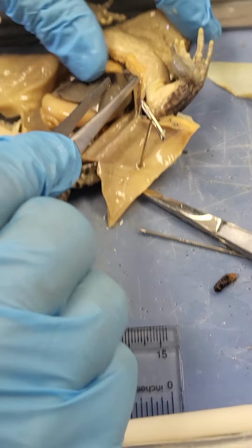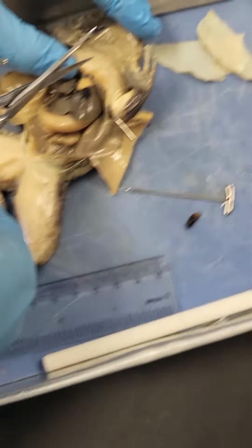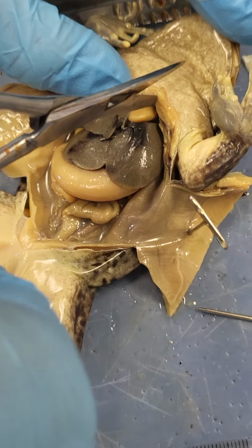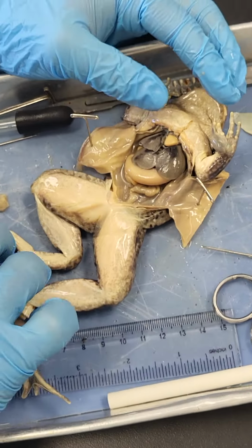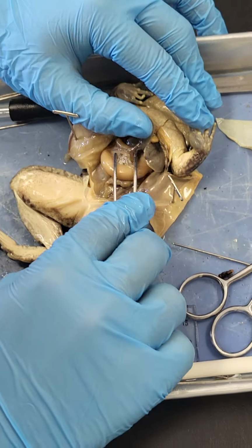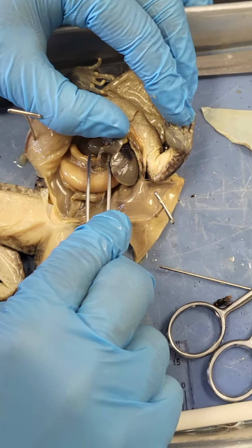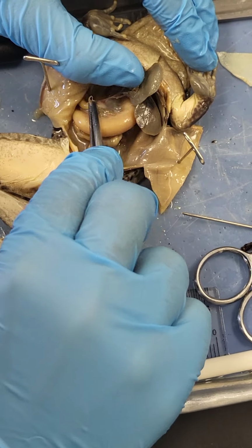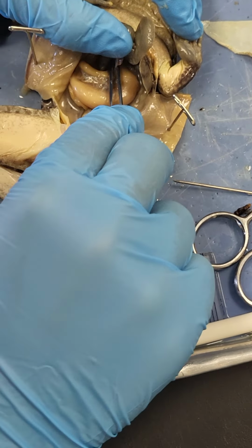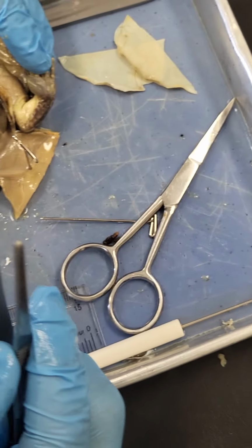Esophagus. Return to the stomach. It's up at the very top part of the stomach. Hold up. No, you don't have to. Look at the stomach. It's gonna be at the stomach. Don't make any juices fly anywhere. You have to go to the stomach and then go up. You find it? It just goes up. Yeah, you can see it. Yeah, I see it.